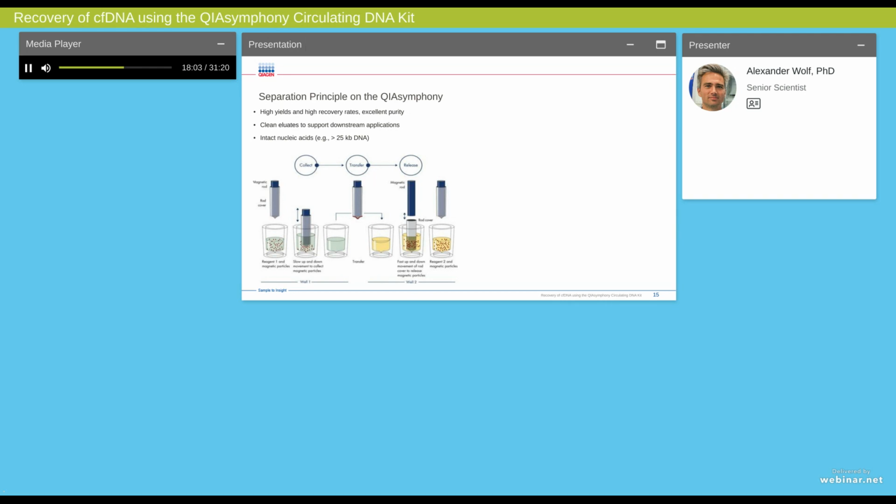On the left-hand side of the figure, a sample, buffer, and beads are distributed in a reaction vessel. Then, using a magnetic rod protected by a rod cover, the beads are collected and bind quantitatively to the rod cover. Then the beads can be simply transferred into a new reaction well in which new buffer is already dispensed by the 4 pipetting channels of the instrument.